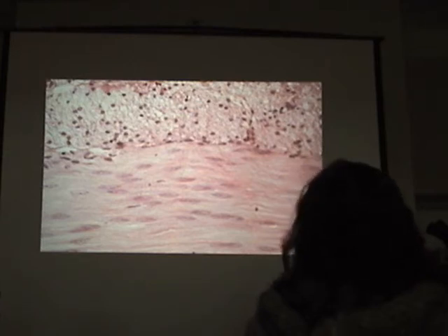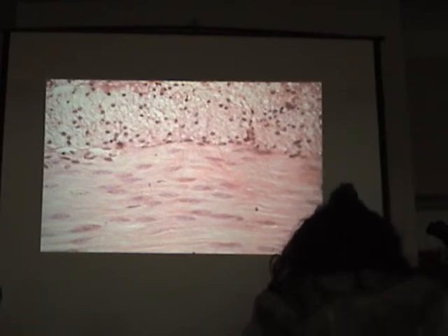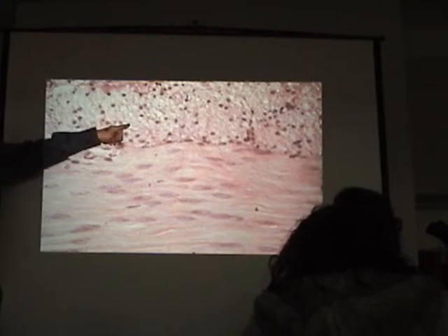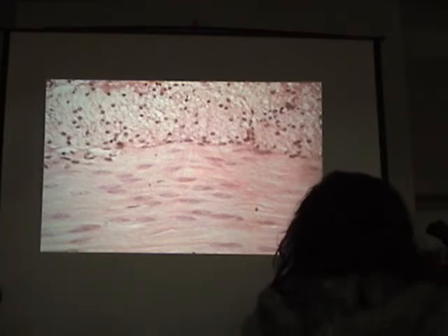All right? These cells are probably only 5 microns in diameter, maybe 200 microns long, but they taper. They're what's called fusiform. So you get a packing density that gives you the profile when it's cut in cross-section. Clearly where you see nuclei, you're cut in the middle of the cell. If you look here, you can see circular profiles of varying diameters. The smaller they are, the further away you are towards the tip of the cell. It gives you a nice packing density.